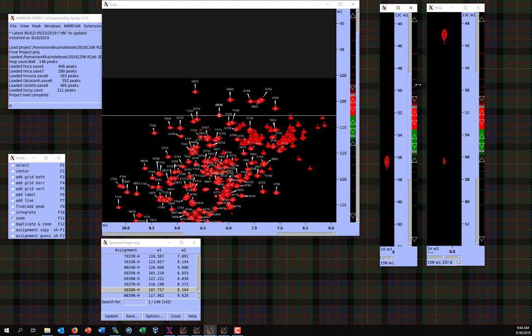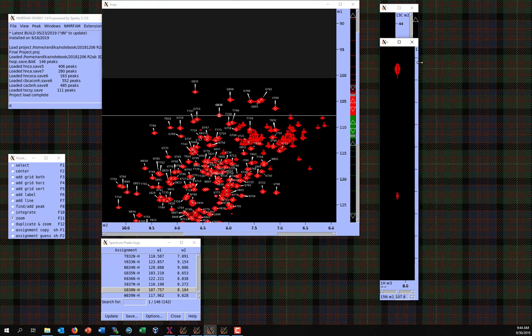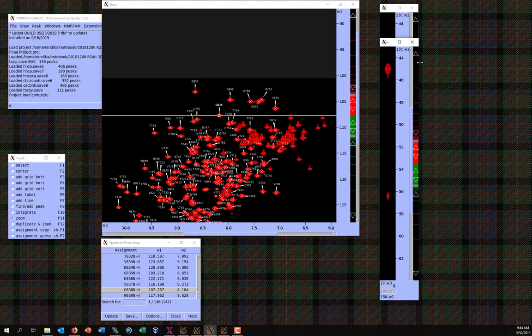If you're doing multiple strips, like we're doing here, what you might want to do is get it as close as possible so that you can have them be identical. You can get very, very particular and even anal retentive with this kind of stuff. I find that it's not so useful to pick on it that much.